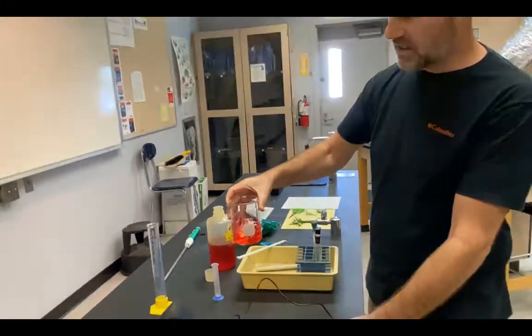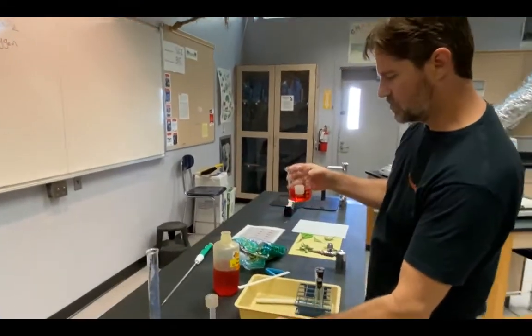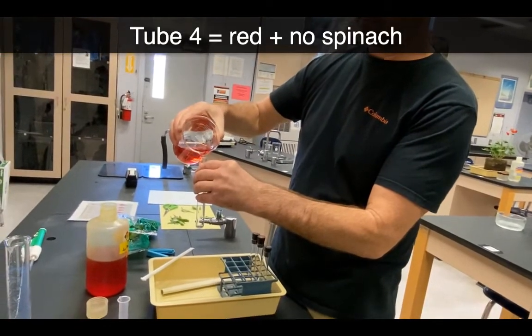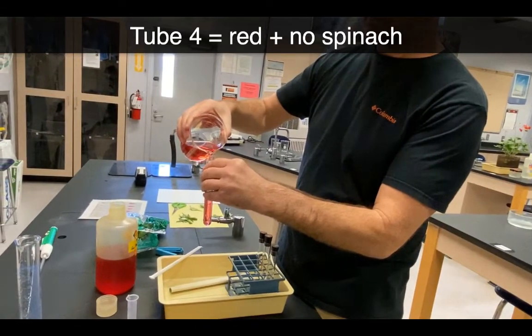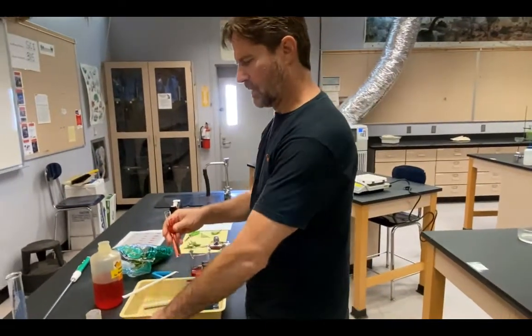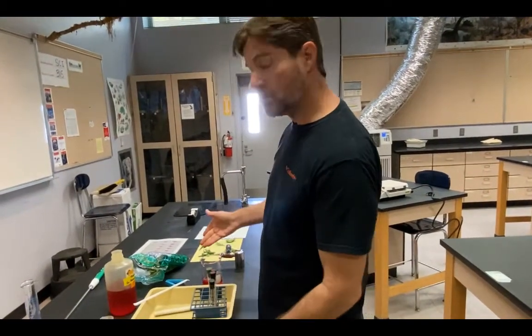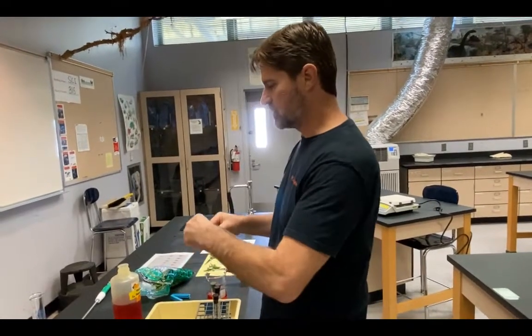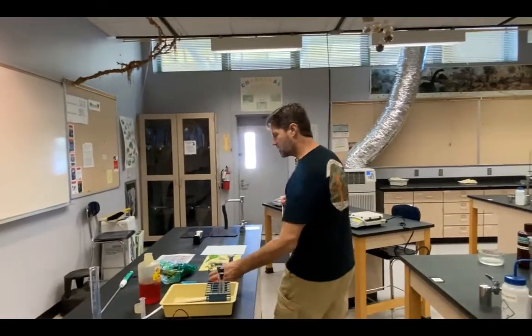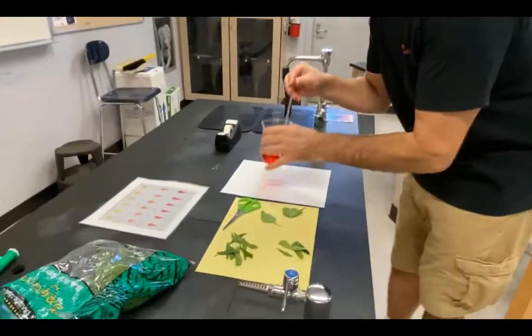One of these is going to get phenol red just as we see it right now. So I'm going to add some of that to tube number 4. And once I do that, I can cork tube number 4. And I can get prepared to add carbon dioxide to this to ensure that we have an acidic environment. So I like to do this with some white paper. It helps me detect the color change.